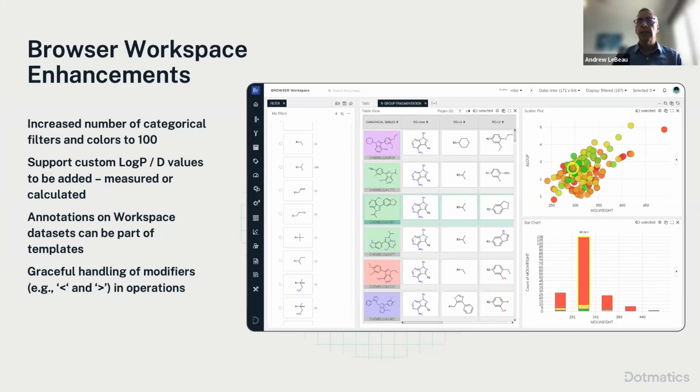We've made some enhancements now where you can split the modified part out, you can then use them as categories or modifiers on charts, etc. So you don't lose that important information with modified measured values.